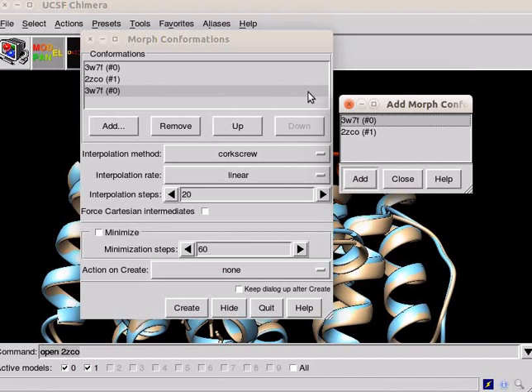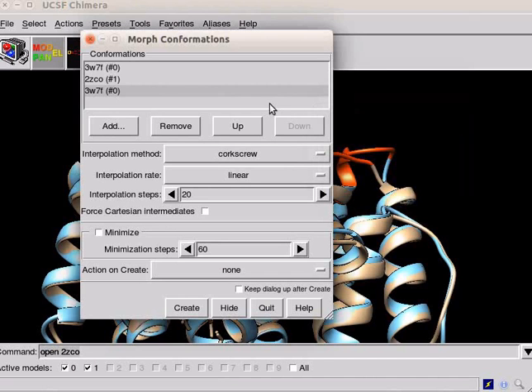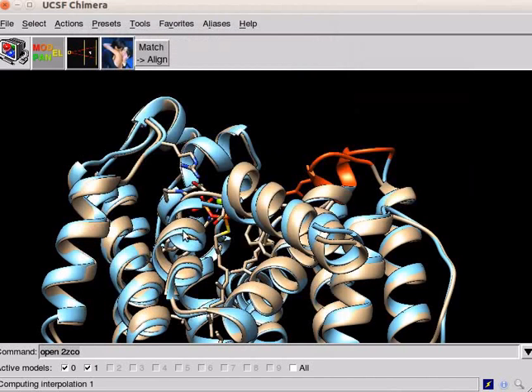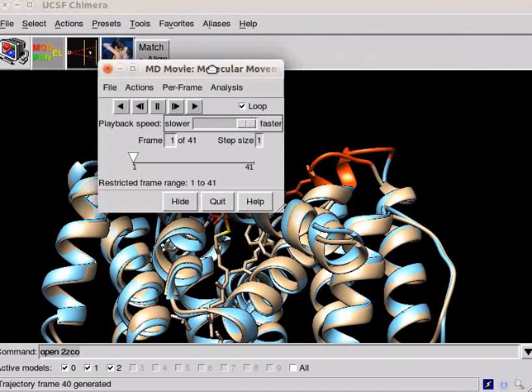This sequence corresponds to a morph trajectory from ligand bound structure to empty structure and then back. Close the model list dialog. Click on create in the morph conformation dialog box. After a few seconds, an MD movie is created. The dialog box appears on the screen.